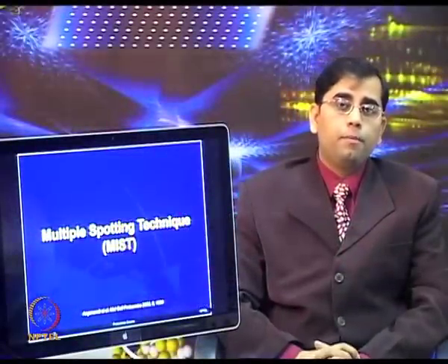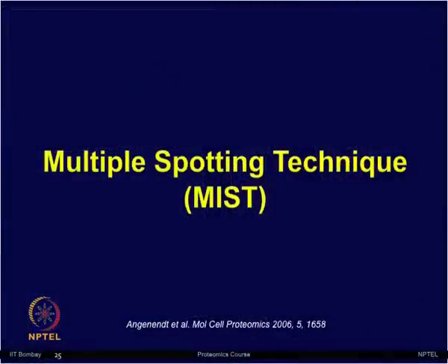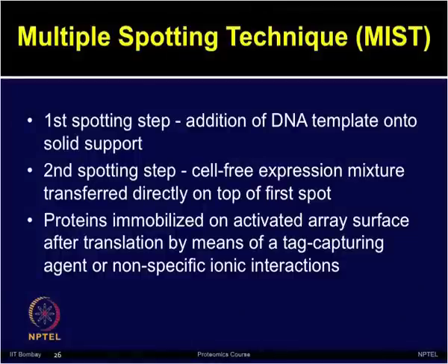Let us now move on to the multiple spotting technique, also known as MIST. This is another approach which facilitates generation of high density protein microarrays by using a cell-free expression system. So, unlike the NAPPA approach, in which printing was performed by adding a mixture of cDNA containing GST tag, BSA, BS3 and the capture antibody, in the MIST approach, both DNA as well as the cell-free expression system are printed on the chip surface.